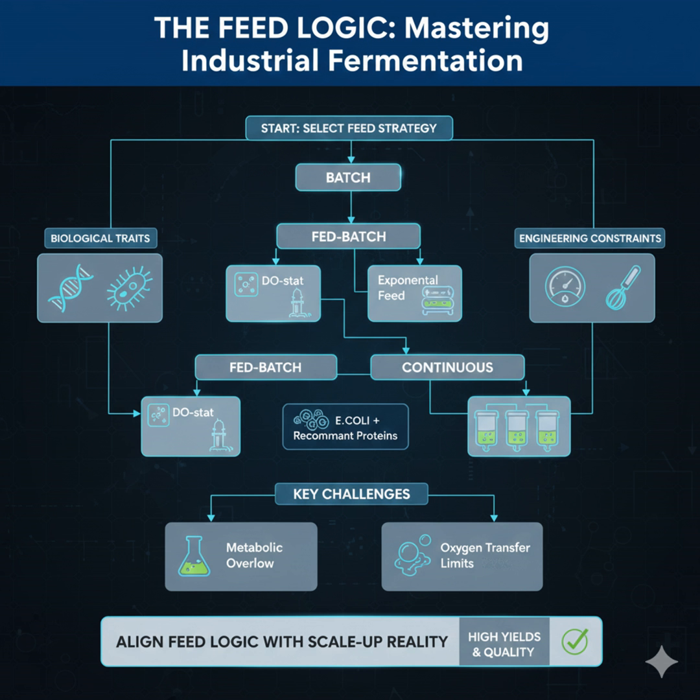It is ideal in theory, but the fatal flaw of the exponential feed is scale-up. Because the feed rate increases exponentially, it guarantees that at some point, the theoretical OUR requirement of the culture will exceed the maximum OUR capacity, the OTR, of the vessel. It's a guaranteed collision. It is, and the sources really stress this. You have to calculate the exact moment that limit is hit, and then you derate your exponent to ensure the feed rate never pushes the OUR beyond your safe ceiling. Failure to do that leads to a guaranteed batch crash.